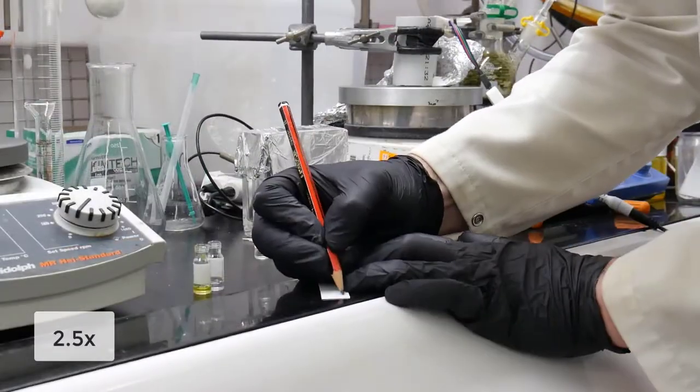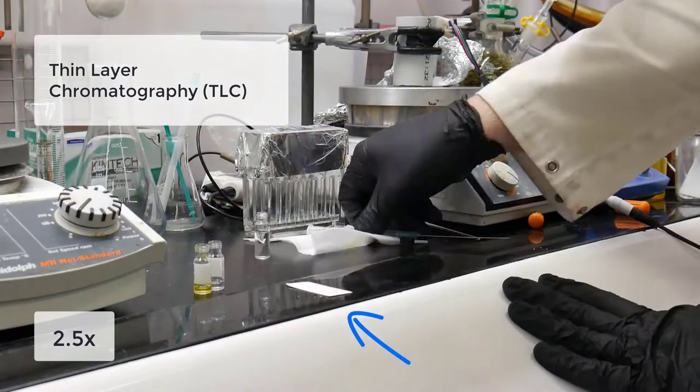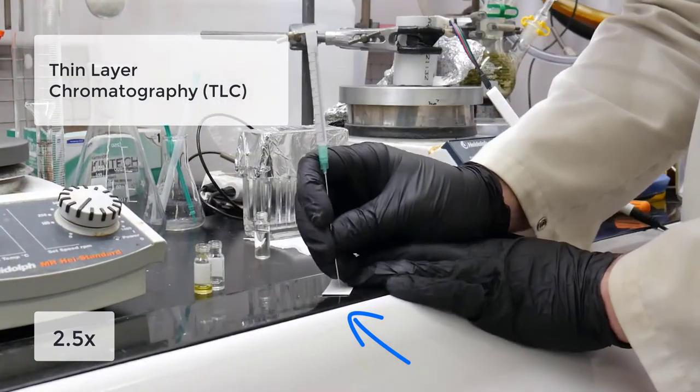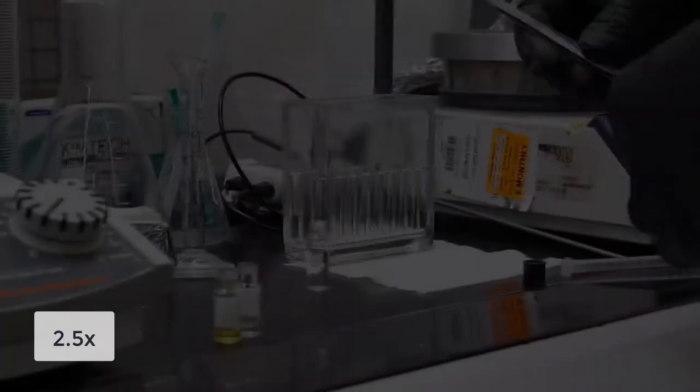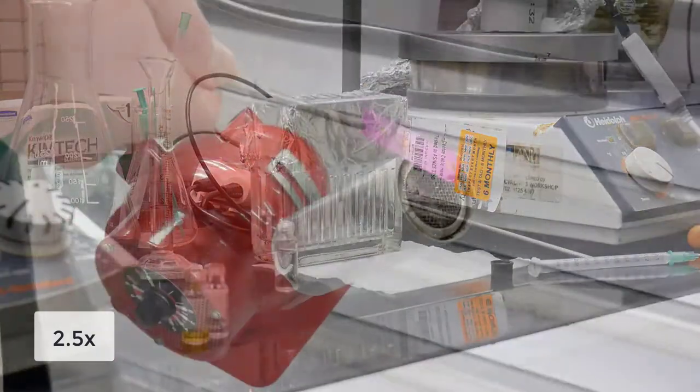Firstly we have to run a thin layer chromatography plate, which lets us know exactly how much our compound is going to stick to the stationary phase.